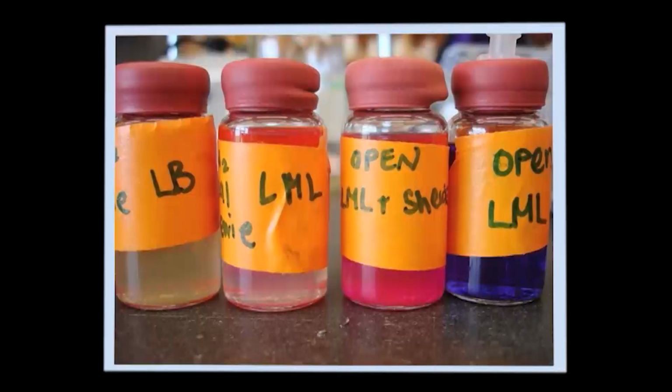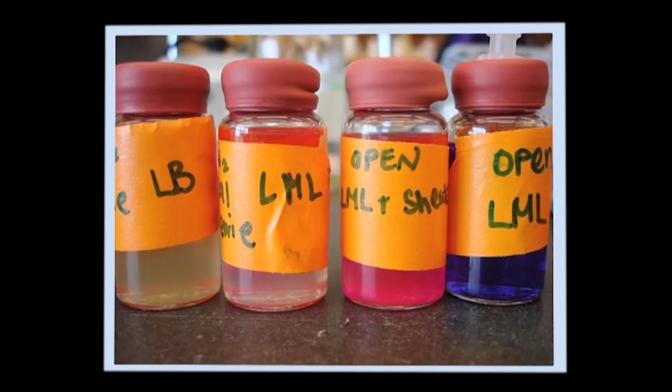Now, similarly, when we add resazurin to the milk samples, we can find a different array of colors. After it is added to the milk sample, if it remains blue in color, it indicates good quality milk. If the color changes to pink or light pink, then the milk quality is of fair type. If the milk becomes colorless after addition of resazurin, then the milk sample is bad. So, in this way, again, we can differentiate between the milk samples.